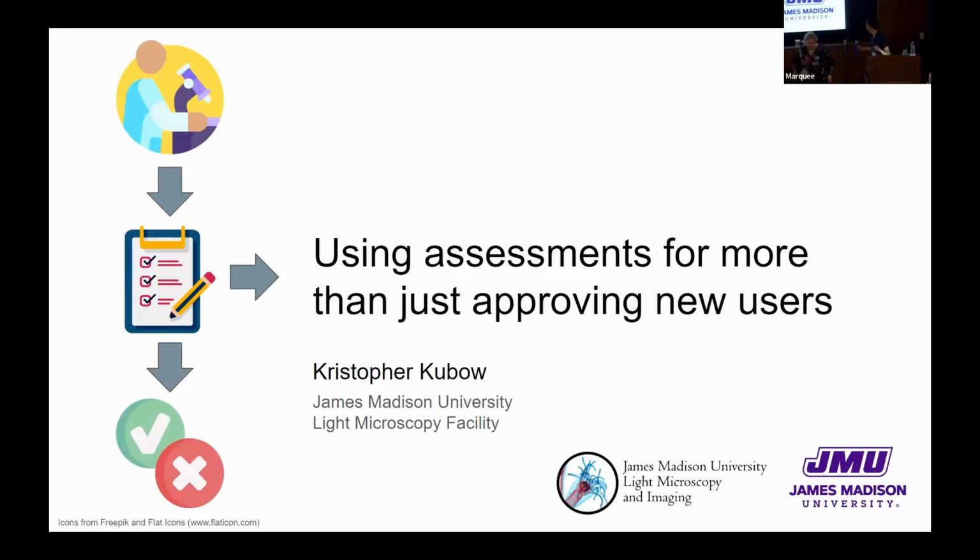Thank you. So I'm going to be talking about one aspect of what Sylvie talked about earlier, and that's about assessing microscopy training. And this is going to be primarily in the context of a core user facility training new users, but hopefully you can see the principles are generally applicable. So I'm going to be using the terms trainee and student interchangeably. It's just the person who's learning how to use the scope.